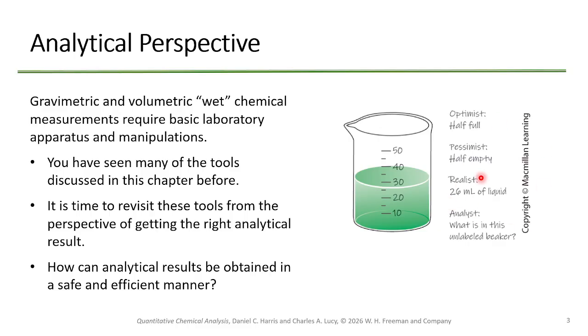Okay? So being analytical doesn't mean just maxing out your precision every single step. It means knowing where to cut precision and what is meaningful precision. Okay? If you're adding something in excess, does it matter how much you add? Not really. You just need to add more than you need. So do you have to weigh it out super accurately? No. Does it matter how accurate the label is? No. If you're adding 3 times versus 4 times, it's not going to make a difference.